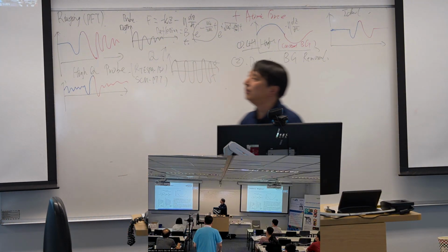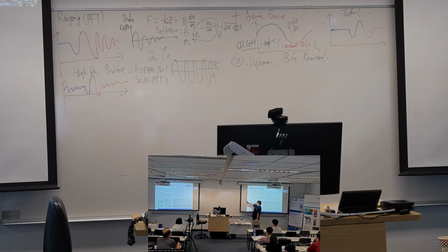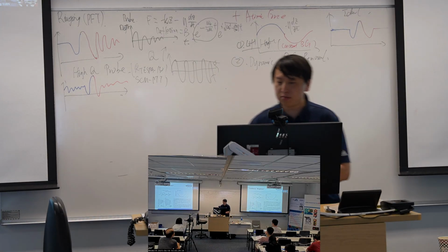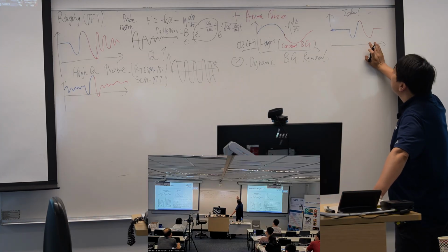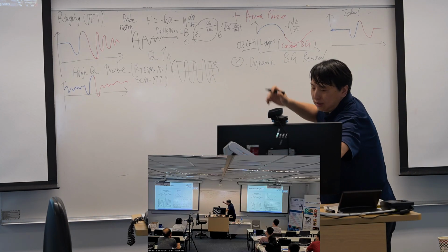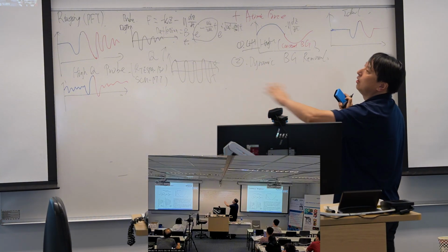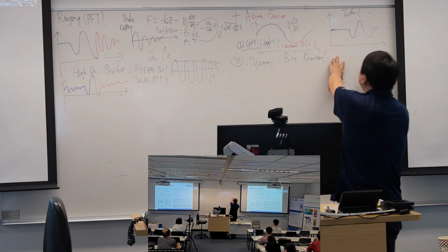So when we have this kind of ringing, we may face a problem. Let's assume we already removed the background due to the hydrodynamic force, and then we only need to face the ringing.